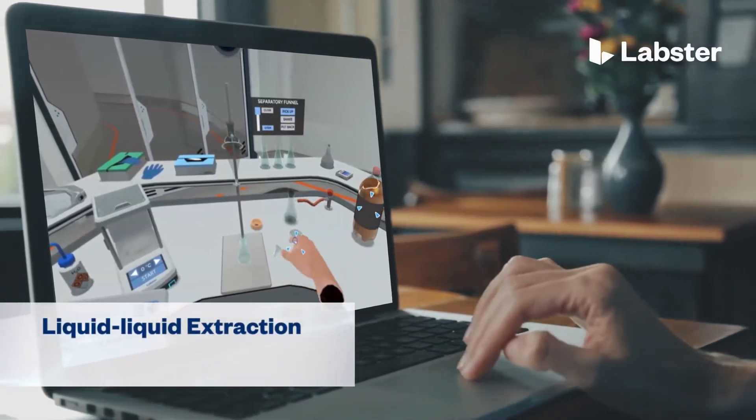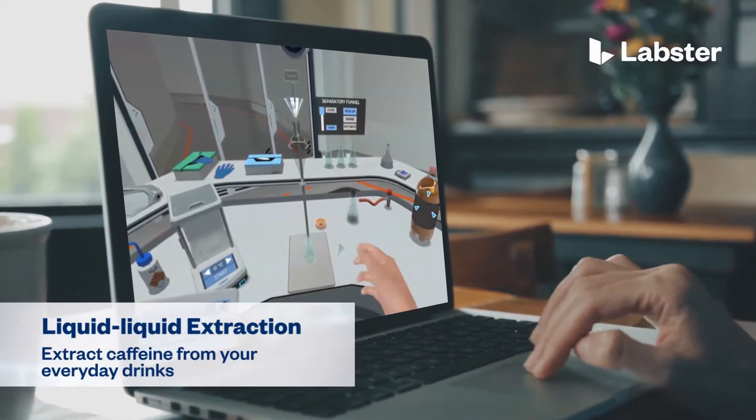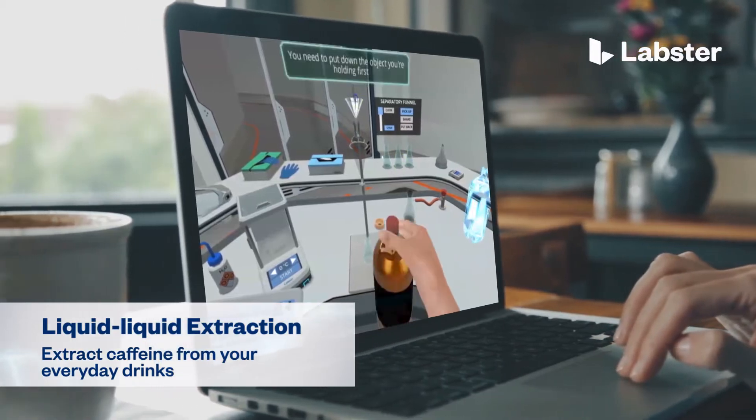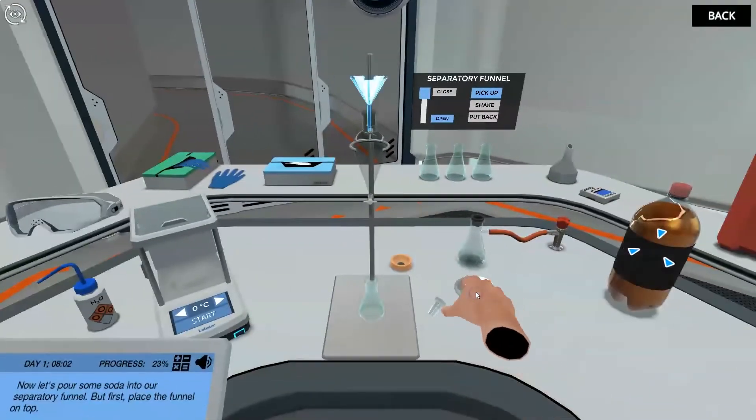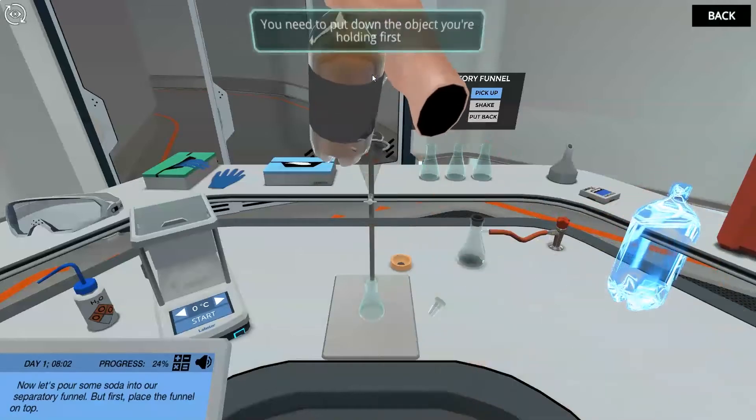In the Liquid Liquid Extraction Extract Caffeine from Your Everyday Drinks Virtual Lab, students step into a realistic lab experience where they can practice, learn, and explore science in an engaging and immersive way.